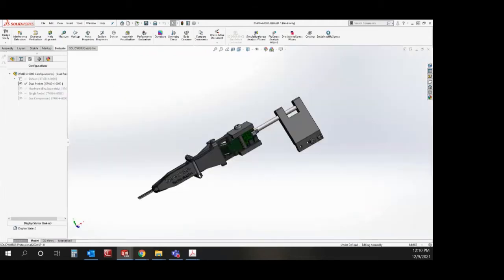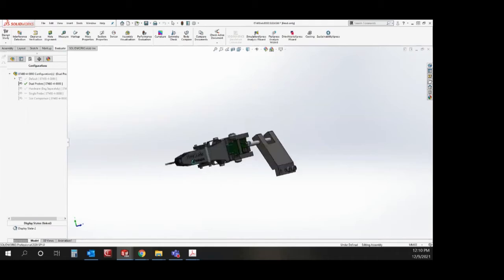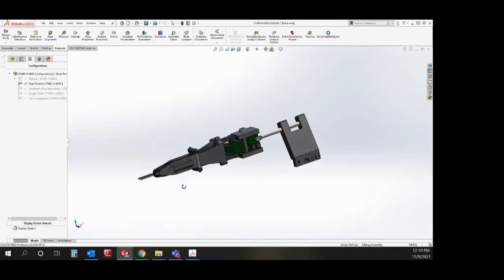Going back to our probe mount, in order to install the probes you'll need to remove this pin.